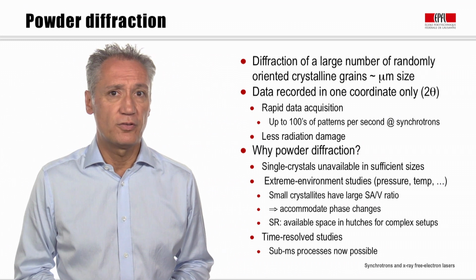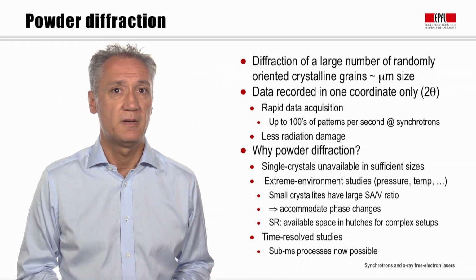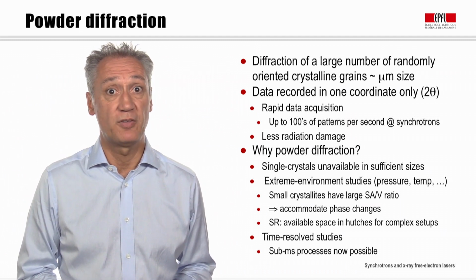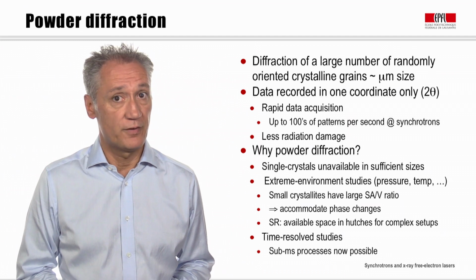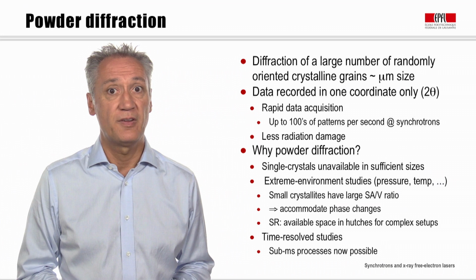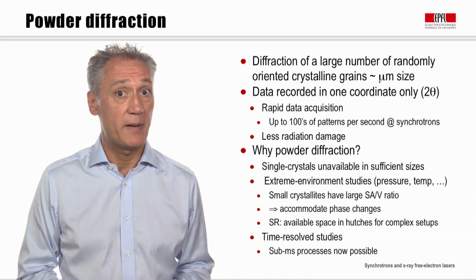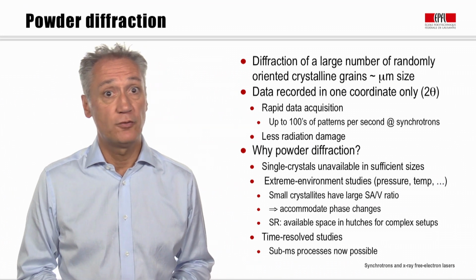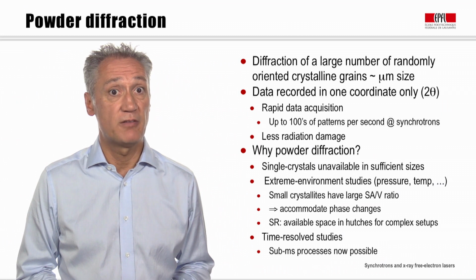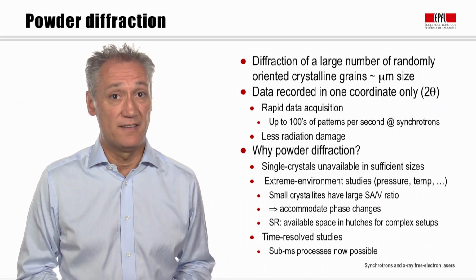The time resolution of such studies has been extended into the sub-millisecond regime since the advent of novel detector types such as the Mythen microstrip detector. For example, the dynamics of self-propagating exothermic reactions in nanoscale metallic multilayers have been followed from powder diffraction patterns over a 120-degree range with 0.004 degree resolution and with a complete pattern frame rate of 8,000 Hz.